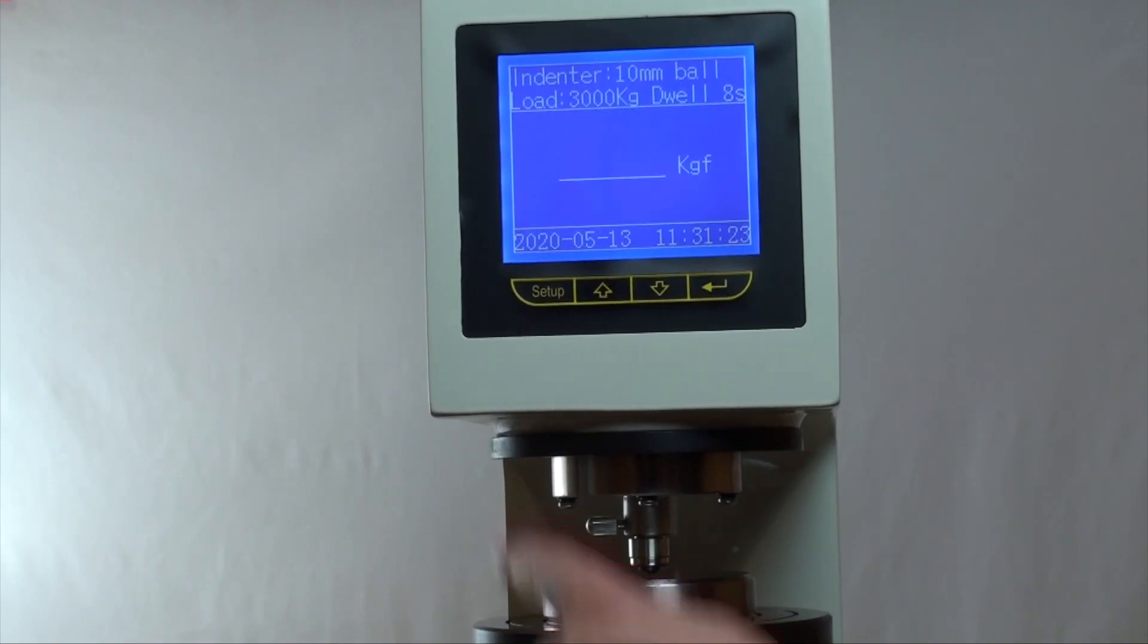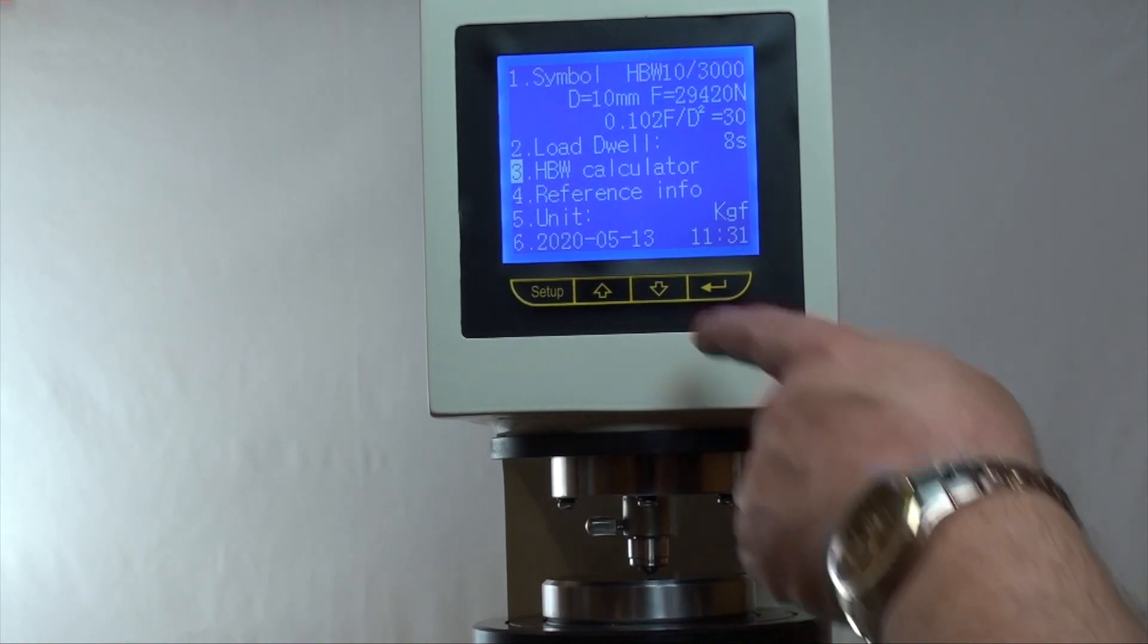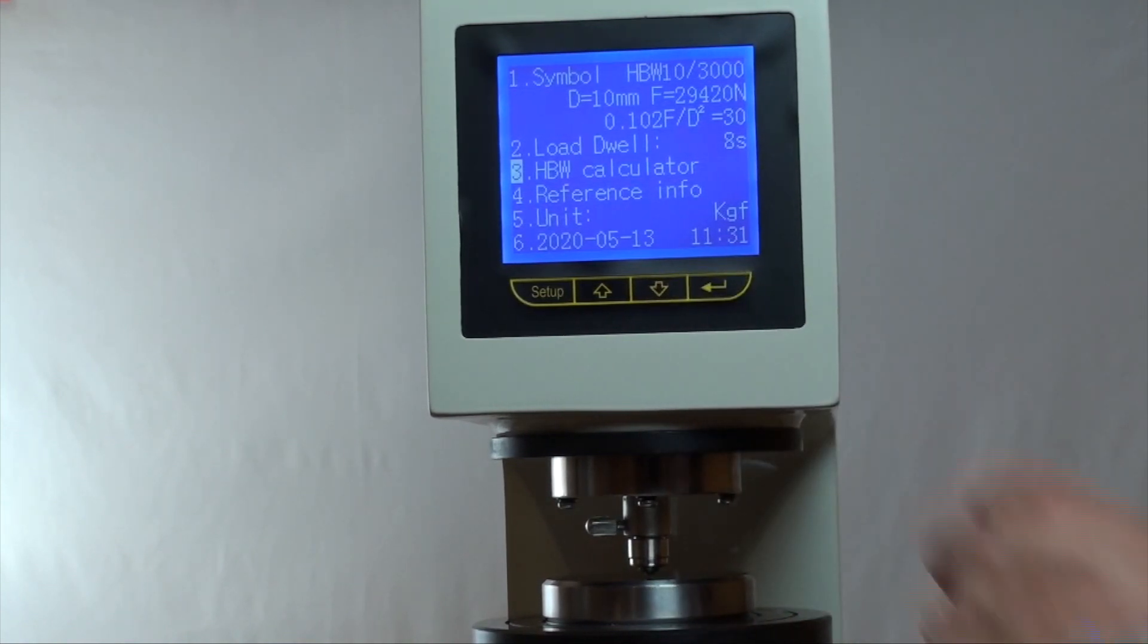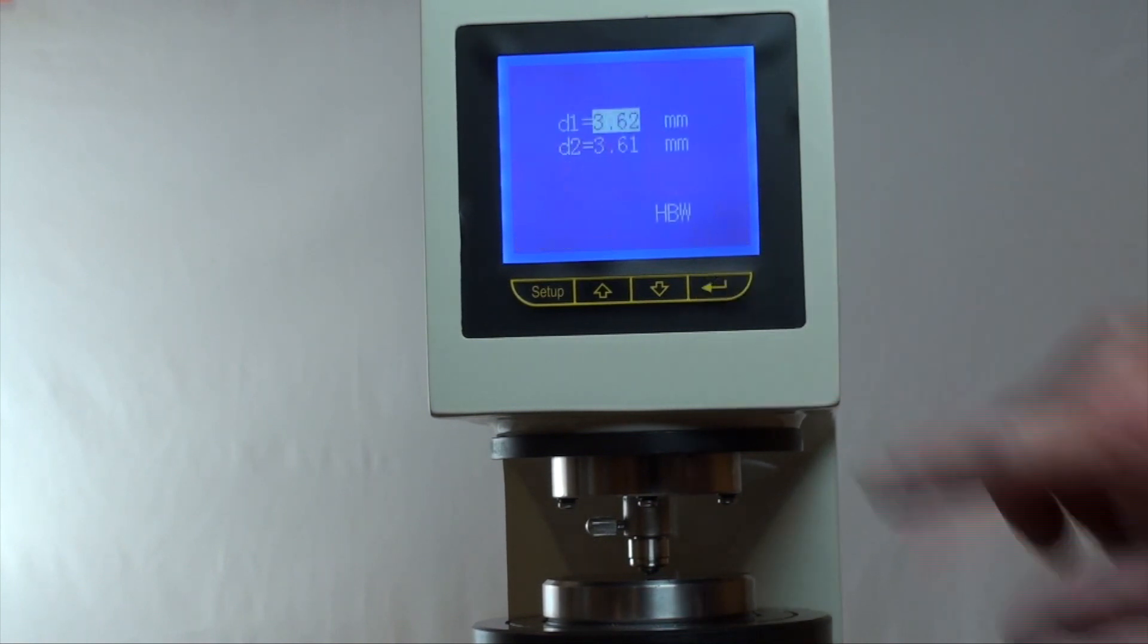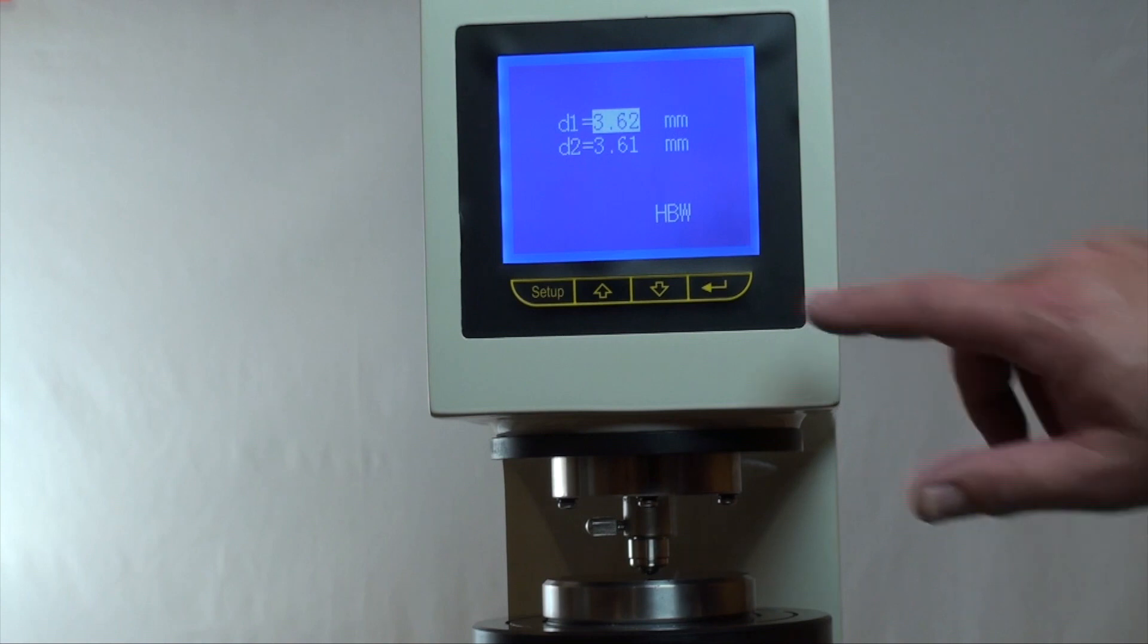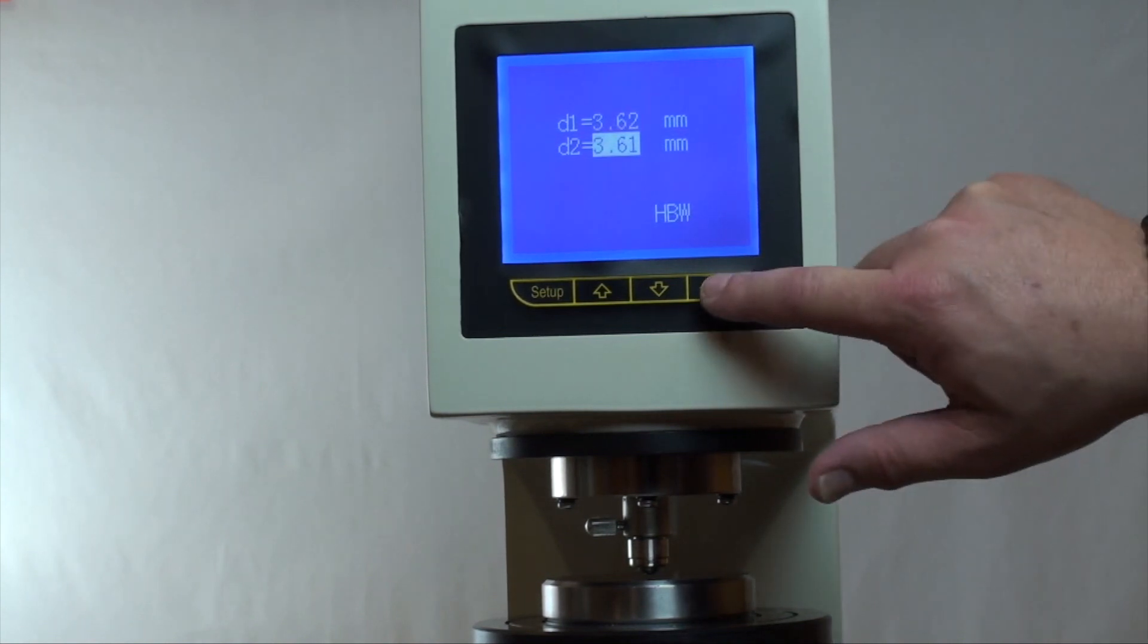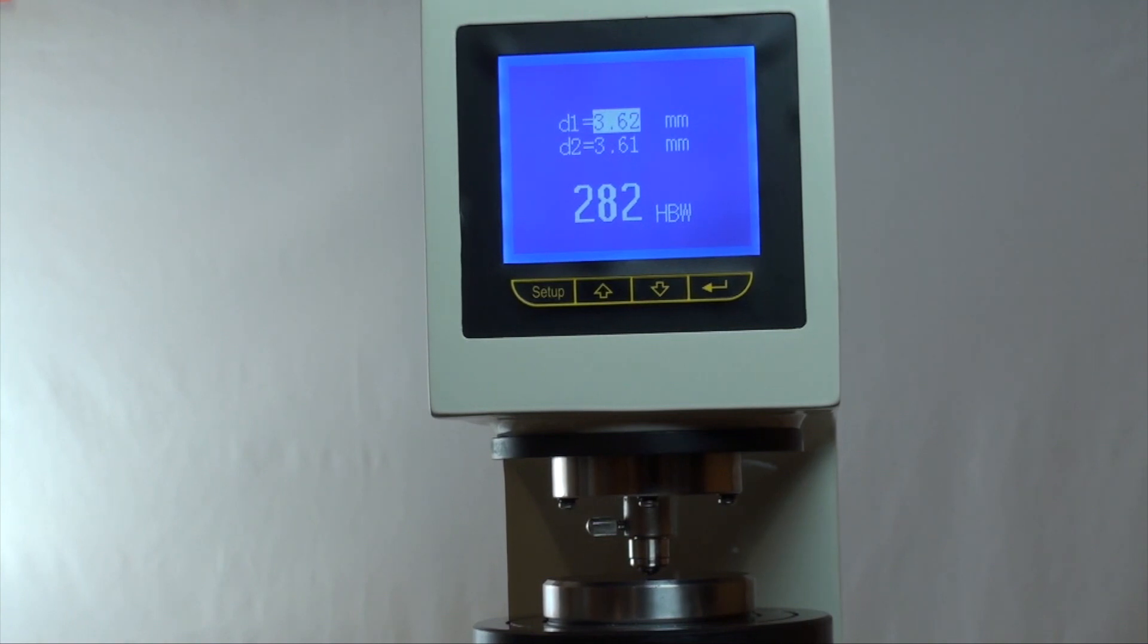Now press setup, then press the up or down arrow key to move the cursor to HBW calculator. Press the enter key to confirm. Then press the arrow key to enter the values of the two diameters, D1 and D2. Press enter to confirm. At that point, the Brunel value will appear on the screen.